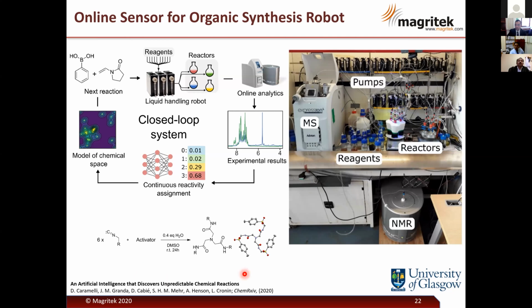This reaction shows the formation of 5 new carbon-carbon bonds. A chemoinformatic analysis revealed that this transformation is both highly unpredictable and able to generate an increased complexity, like a one-pot multi-component reaction.